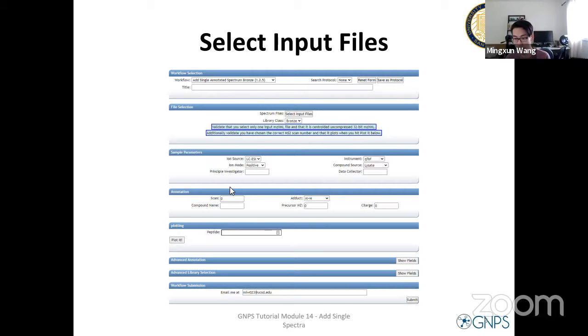And the format that the spectra will need to come in, there's three formats that we generally accept that are open formats. There's two we generally like a little more. So mzML or mzXML is what we generally recommend. And this is usually a full run on the mass spectrometer, whether it's LC or direct infusion, but it includes tens, hundreds to thousands of tandem mass spectra directly in the file.